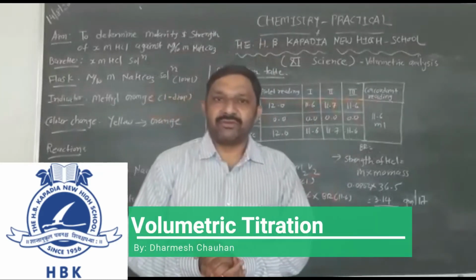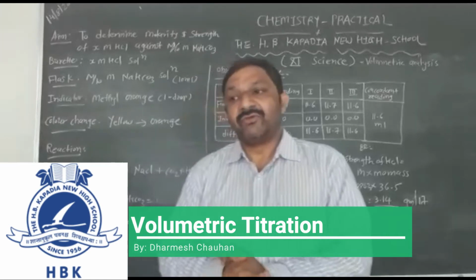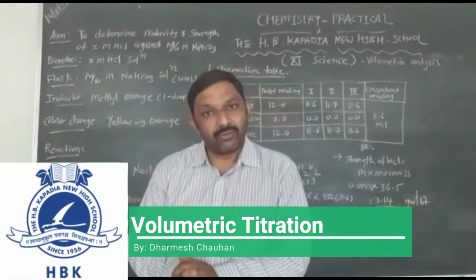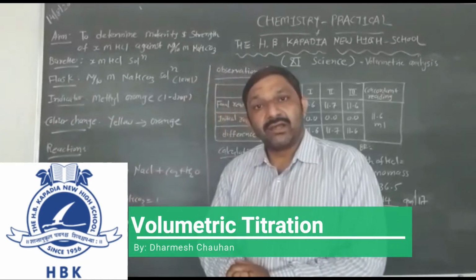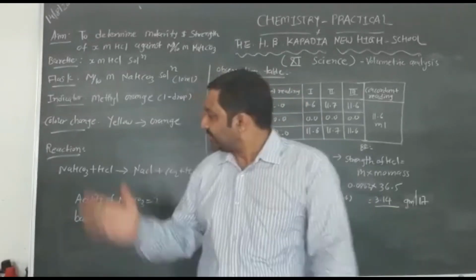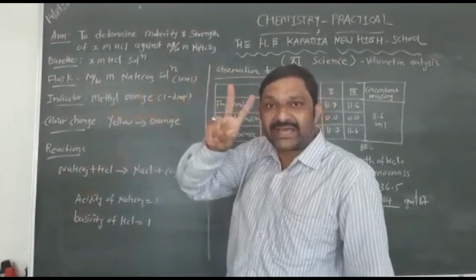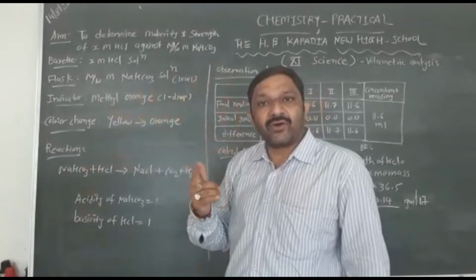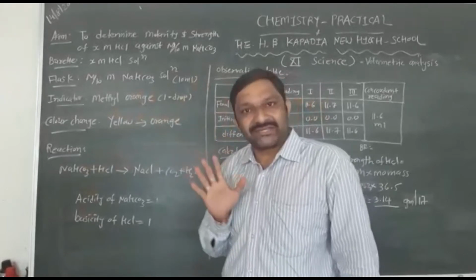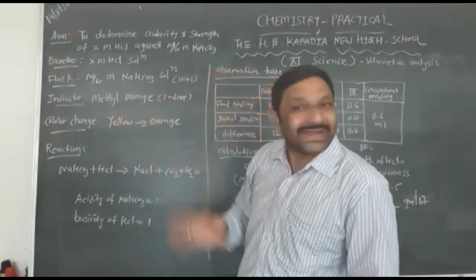Good morning, everyone. Today we will again perform a practical of the volumetric section. Today is the second methyl orange practical. We performed the first in the last lecture. Today we will perform the second methyl orange practical.